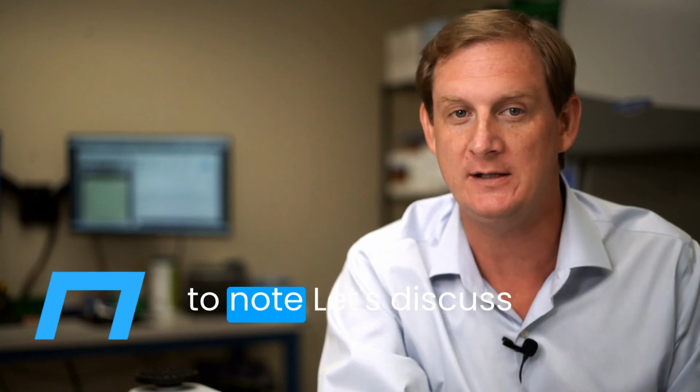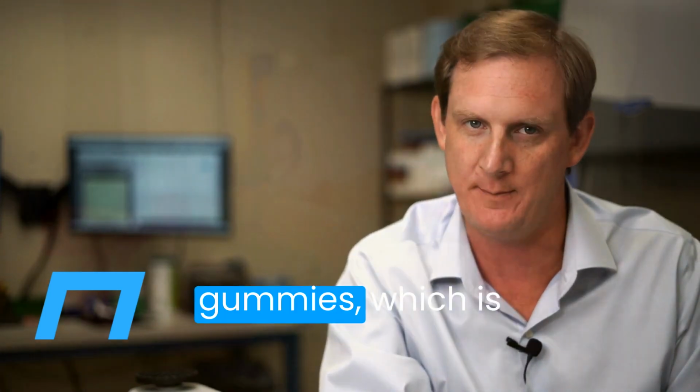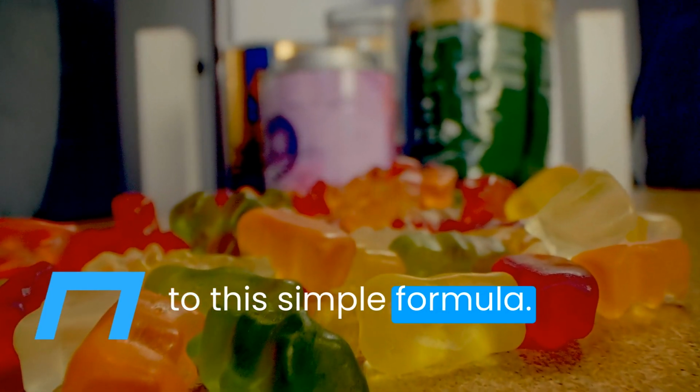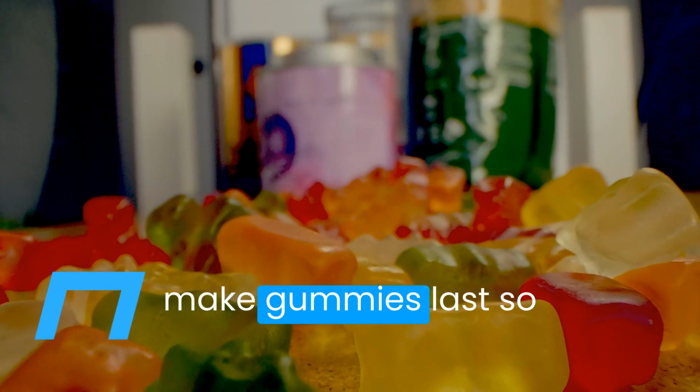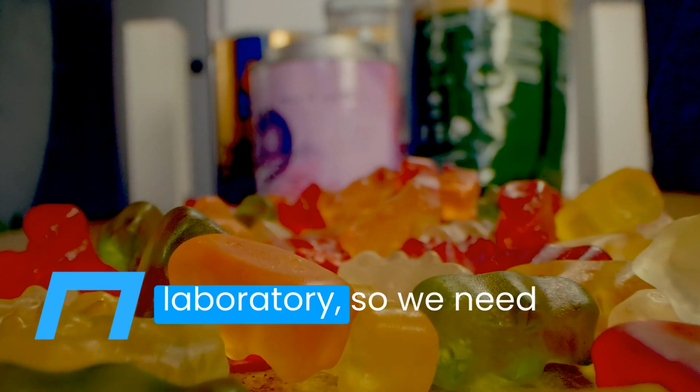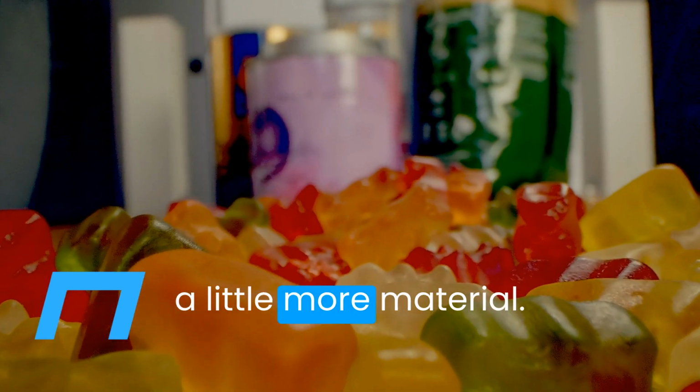There is one other thing to note. Let's discuss gummies, which is another small exception to this simple formula. The binding agents that make gummies last so long when you chew them are also tricky to break down in the laboratory, so we need a little more material.